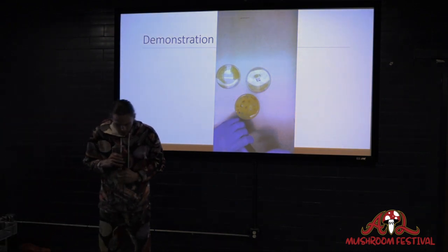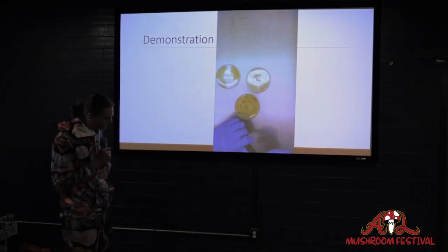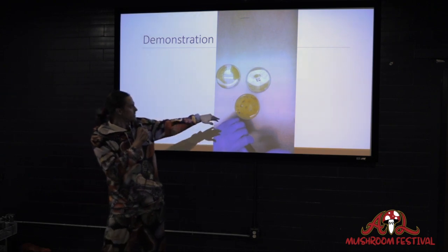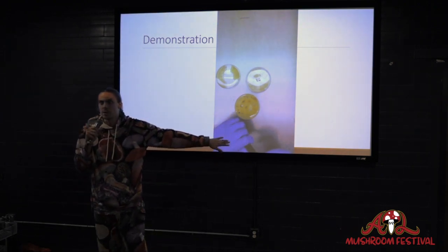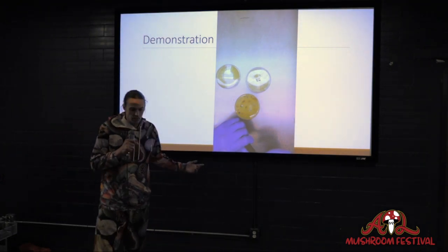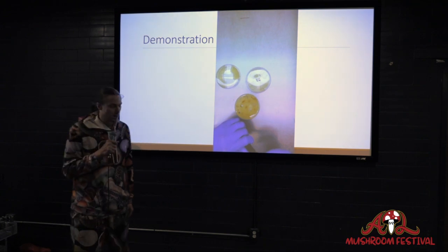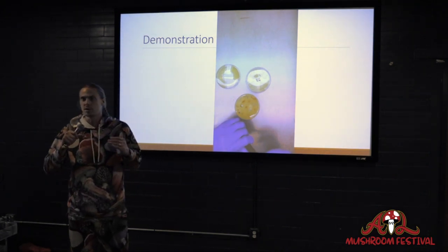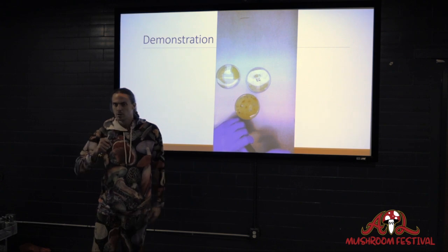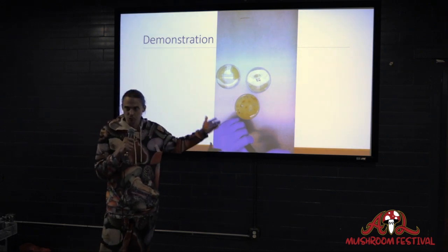Sure. So the question was, why didn't I re-sterilize the tool after collecting each individual sample? In some cases, I actually do that. In this particular case, this culture that I started with produced really clean mycelia. I didn't see a whole bunch of goop. This was a Laetiporus cincinnatus that I collected up in Roswell Mill Park. And the samples I collected produced beautiful, healthy mycelia. There was no fungal contamination on the plate, nor did I see a bacterial contamination on the plate. So I felt it safe enough to resample using the tool multiple times from the same plate.